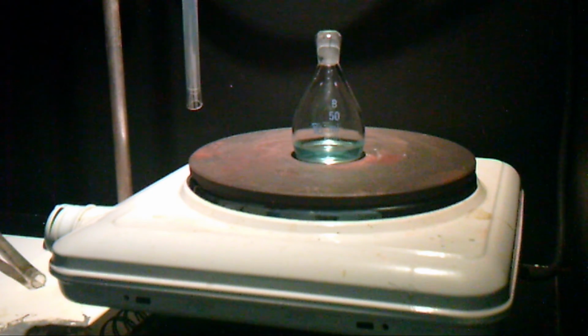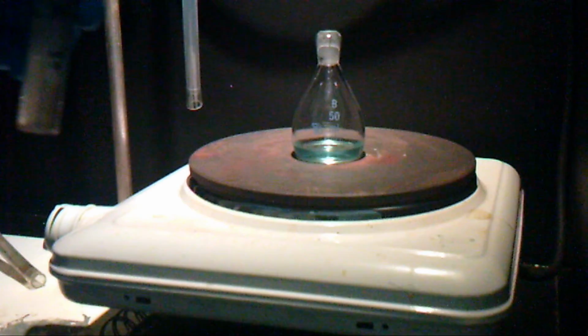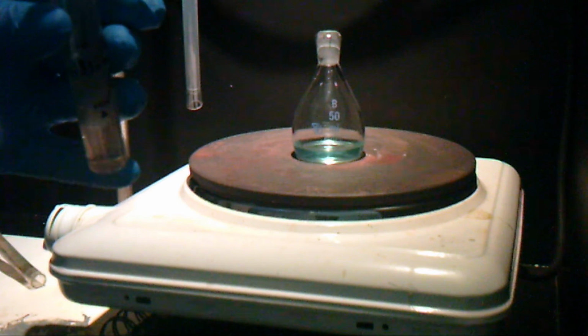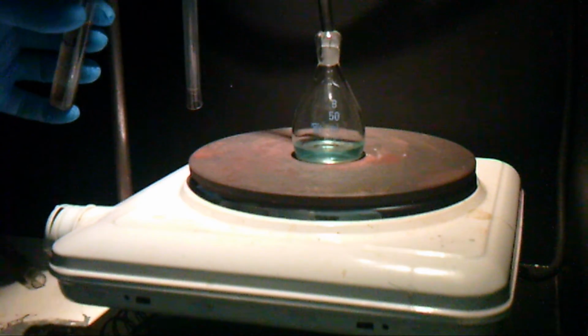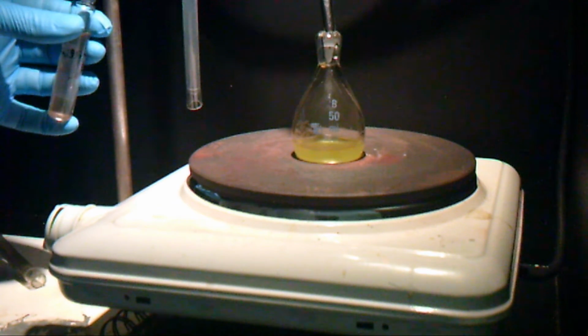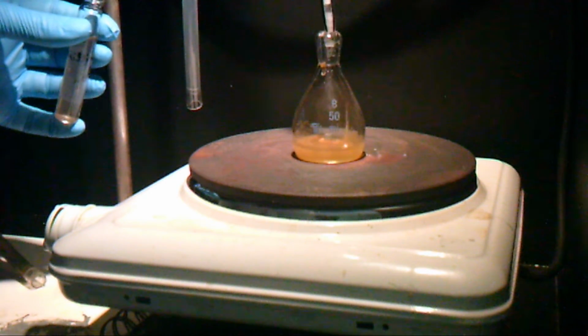So here we have the copper solution, and we bring the 5-iodoaniline, or the para-iodoaniline actually. And with a pipette, we will put drop by drop the solution of the para-iodoaniline to the reaction mixture. Watch closely because it's gonna be fast. Here we put some. Alright, you can see a very fast change of color.